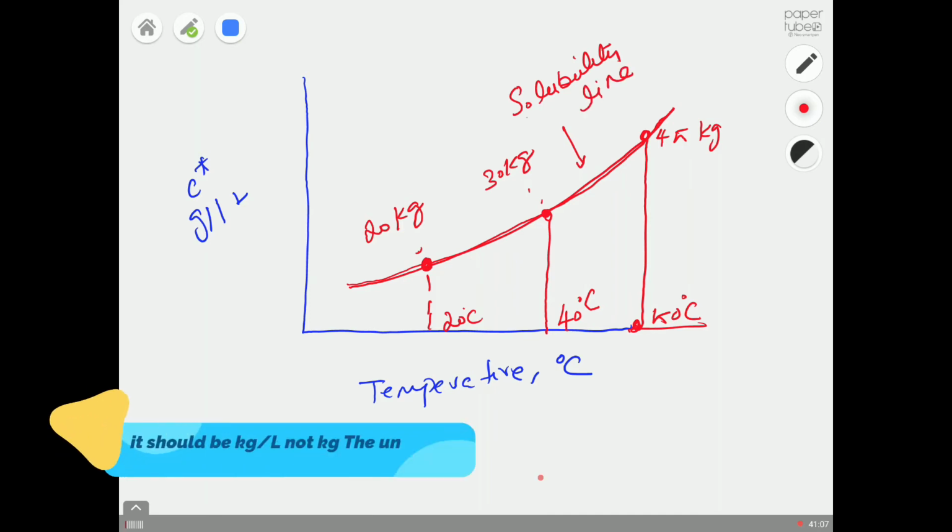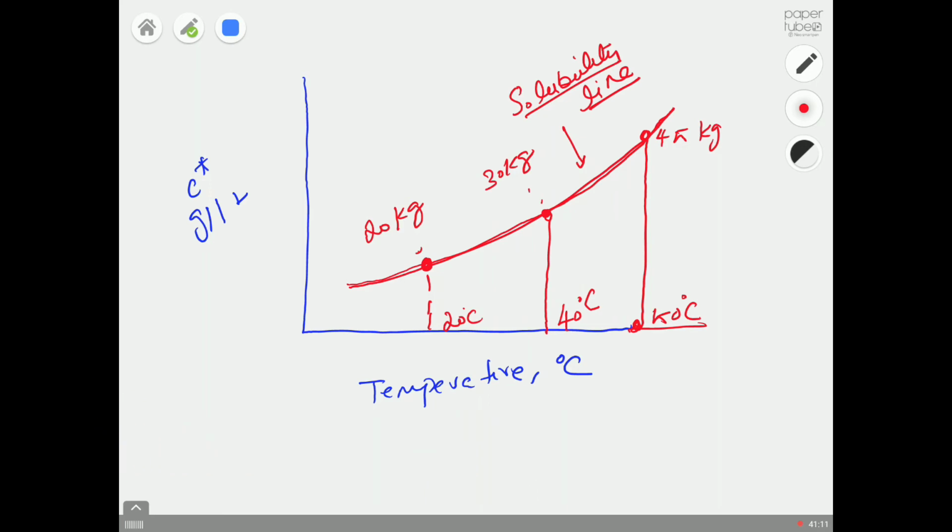You cannot crystallize a compound unless you have the solubility data. Any industry that wants to purify a compound first checks the solubility data. If they couldn't find it in the literature, they will do this experiment in order to get the solubility data. So that's the first thing they do.